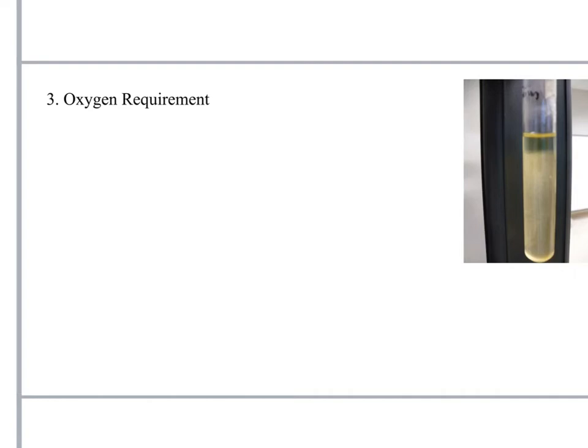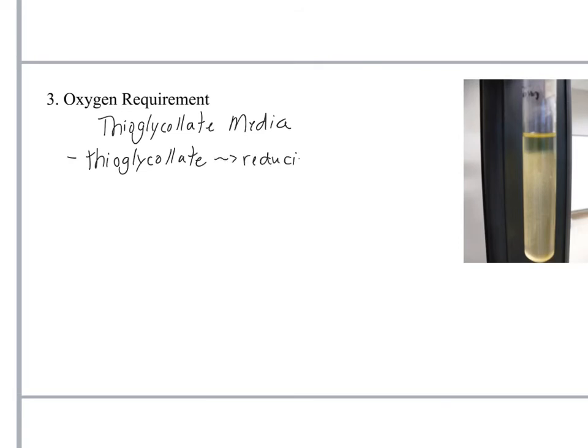Again, organisms that respire aerobically have enzymes to detoxify those. All right, we're going to be inoculating a kind of media called thioglycolate media. And let's look a little bit closer as to what we find in this media. Okay, obviously it has thioglycolate in it. What's that? This is a reducing agent.